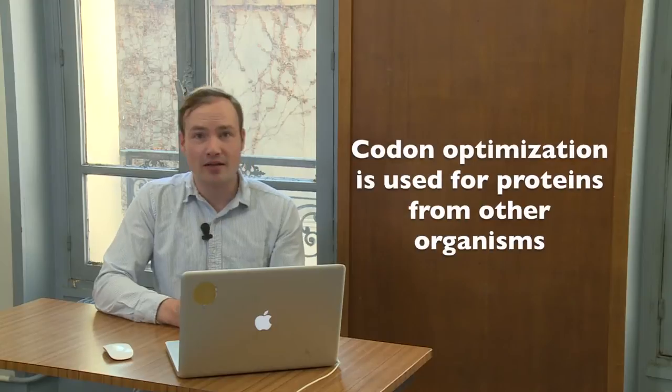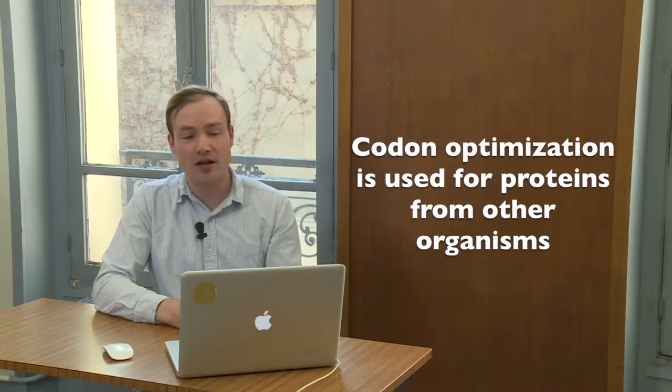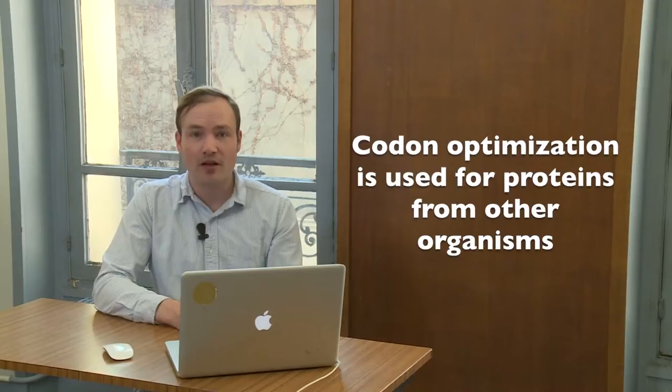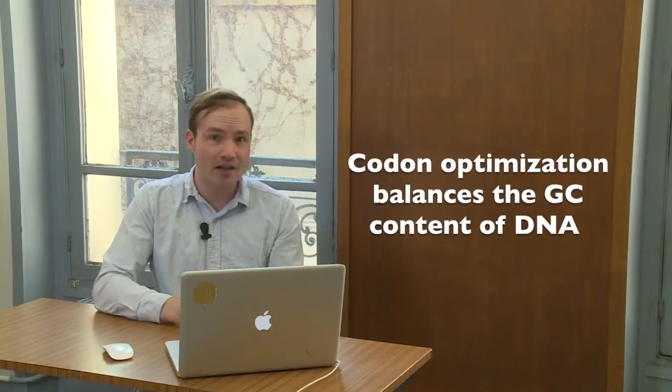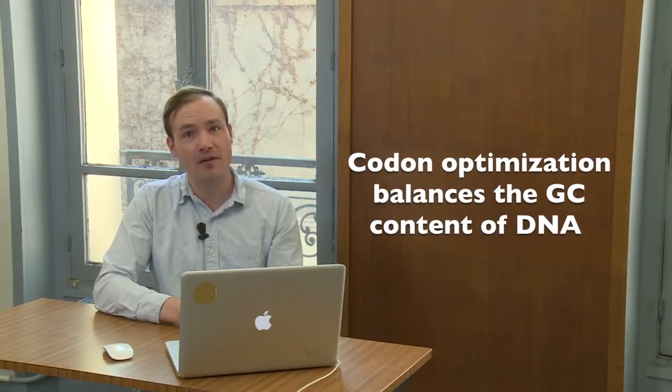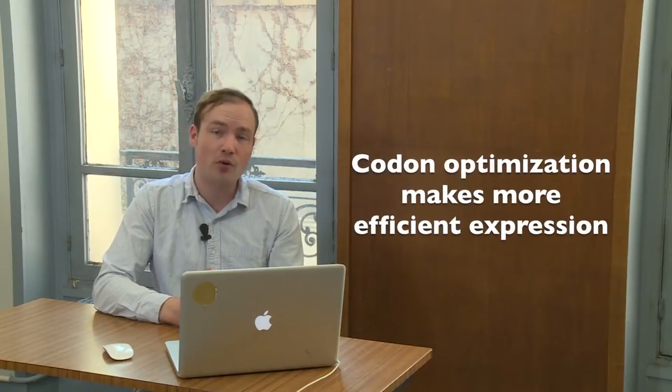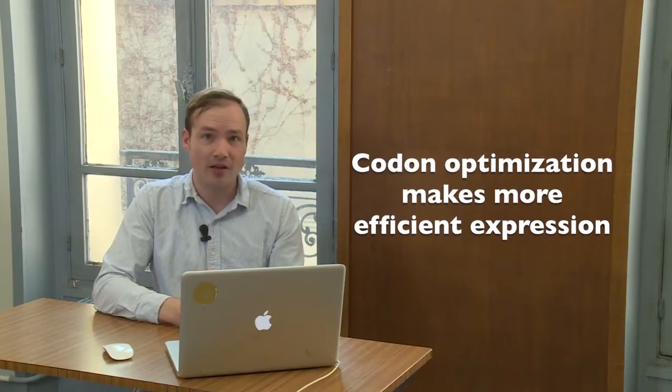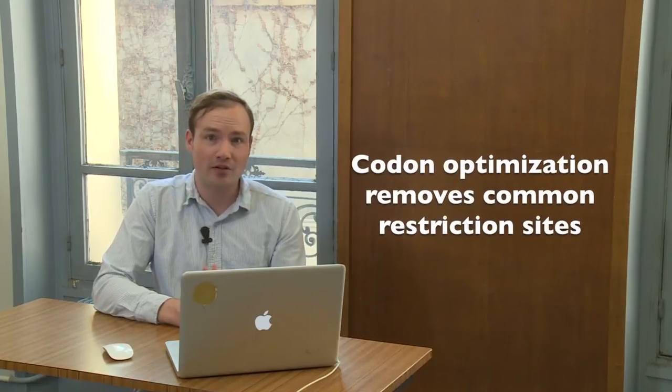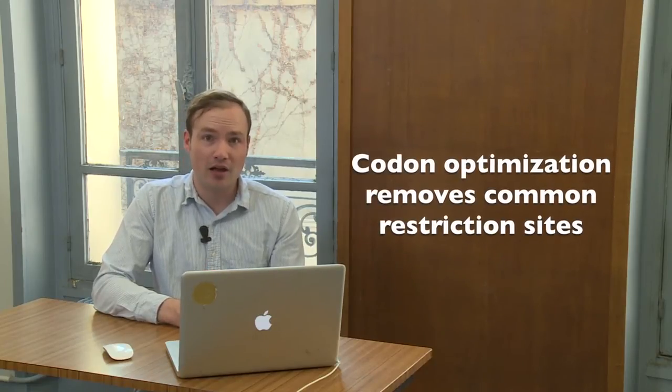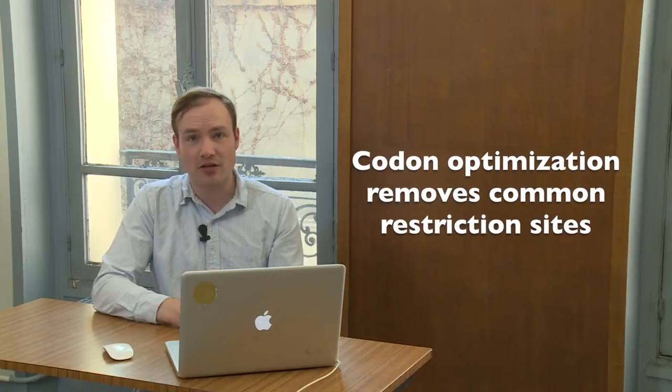Now that we have a DNA sequence, we're going to want to codon optimize it. Codon optimization is something that's in general very useful to do whenever you're expressing an enzyme in E. coli that doesn't come from E. coli. In today's case, our enzyme comes from Corynebacterium. Codon optimization does a few important things: one thing it does is it balances the GC content of your DNA, which is going to make it easier to work with in the lab. Another thing it does is it selects codons that work more efficiently in the bacteria of your choice, in this case E. coli, so your gene will express more efficiently. And the last thing it does is eliminate common restriction sites from your DNA sequence, and again that's going to make your DNA much easier to work with in the lab.